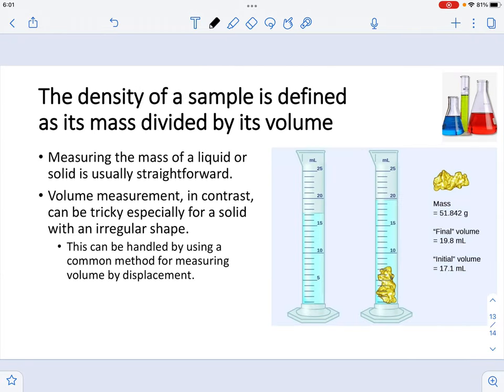In this lab, you are going to watch some experiments on density. The density of a sample is defined as its mass divided by its volume, given by the equation D = M/V. Measuring the mass of a substance is fairly easy using a balance, whether you have a solid or a liquid. However, taking the volume can be tricky, especially if you have a solid that is an irregular shape. There is a technique to determine the volume of an irregular object called volume by displacement.